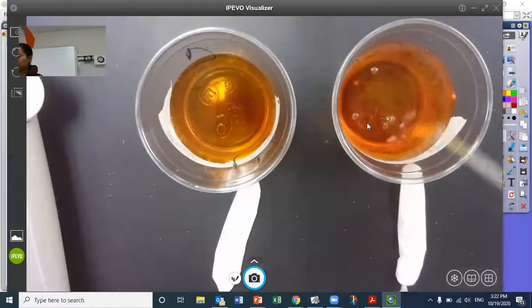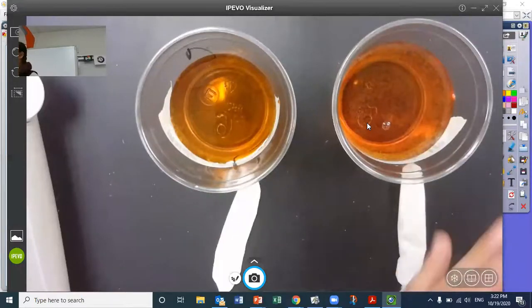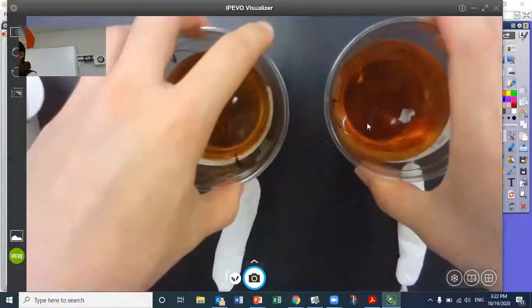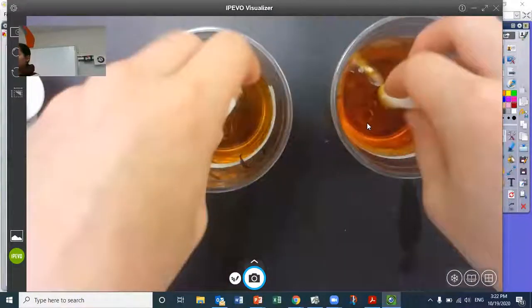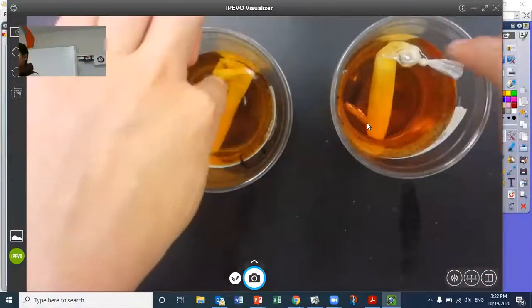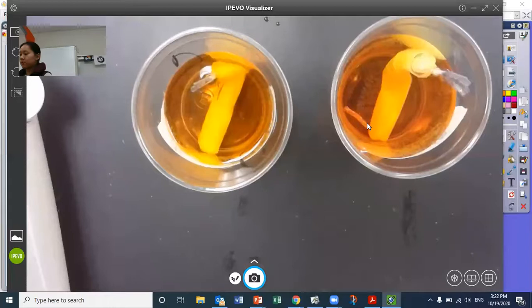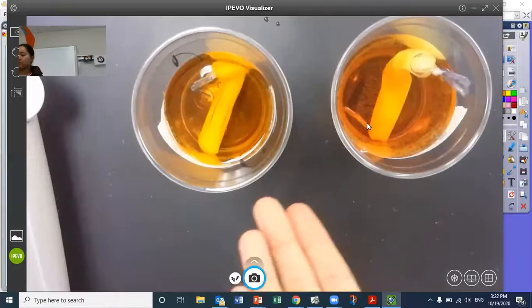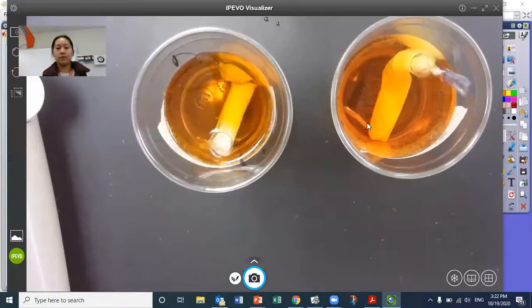We put about 2 full squirts into each one. And we're going to make sure that it has time to kind of spread itself out. And then we're going to put our cells in. So initially, we might not see anything, but we want to see after a while what happens to how they look, what happens to how fat they are, what happens to maybe the color. And so this is our initial setup that you actually drew your diagrams of already. And I will bring you the data and the explanation after we finish collecting data for our final masses.